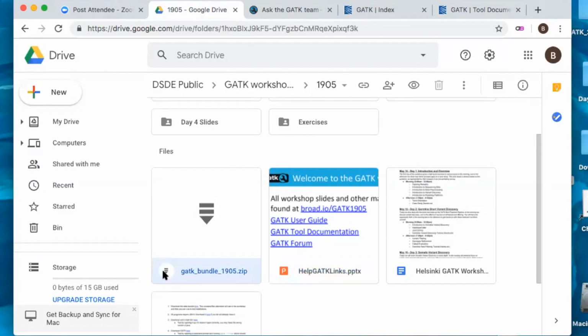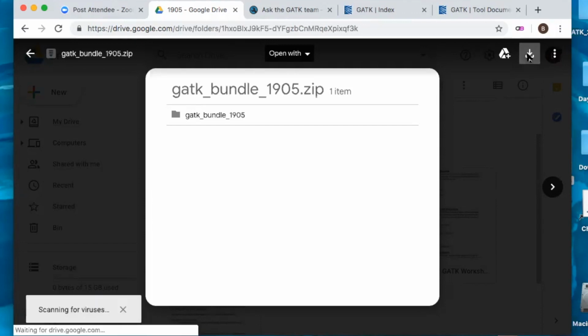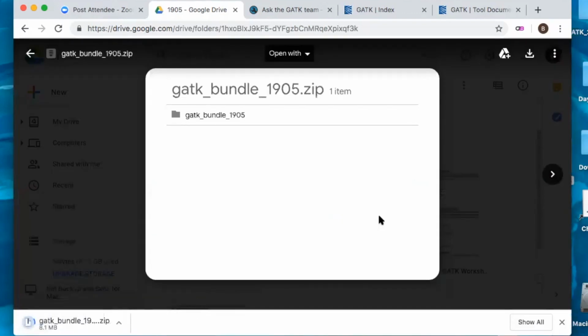Let's go ahead and download that. This has the bundle.